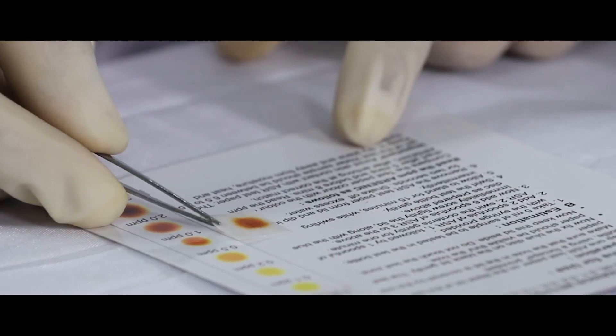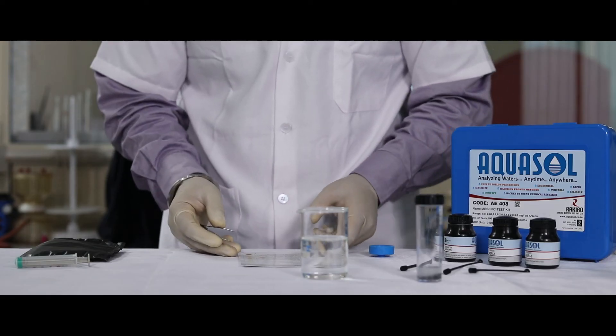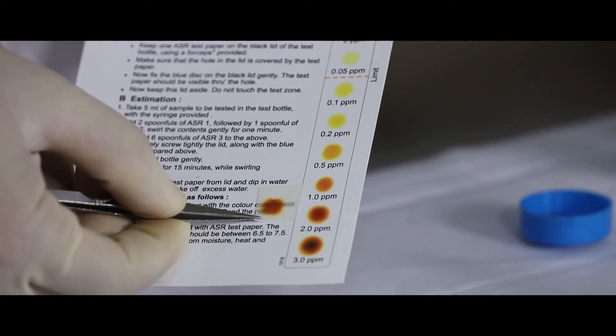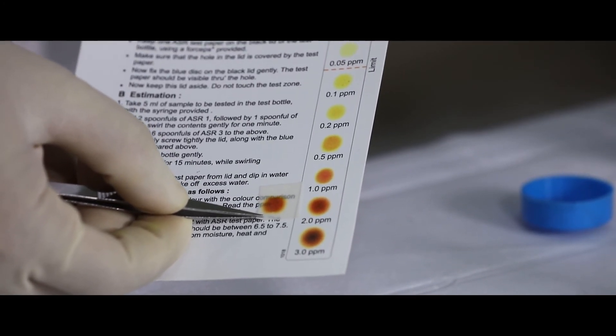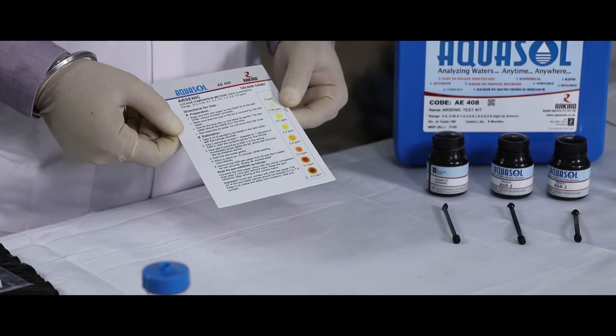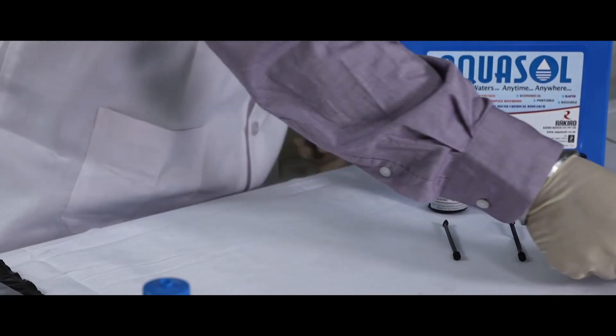Compare the color of the test paper using the chart. The matching color will indicate the PPM arsenic. For better understanding of the product, please refer to the instructional leaflet provided.